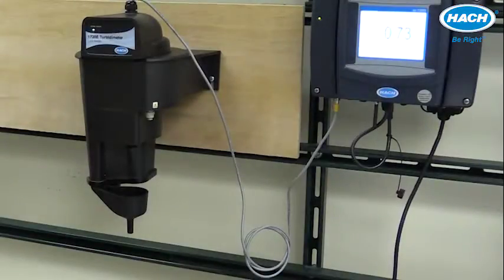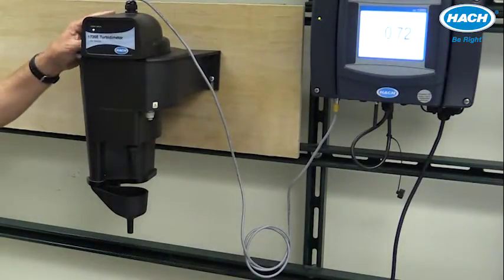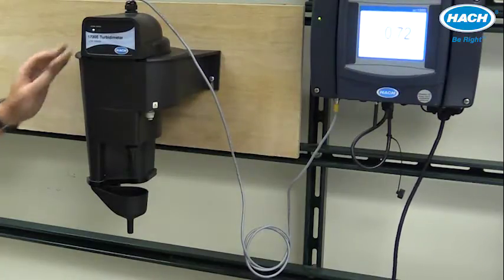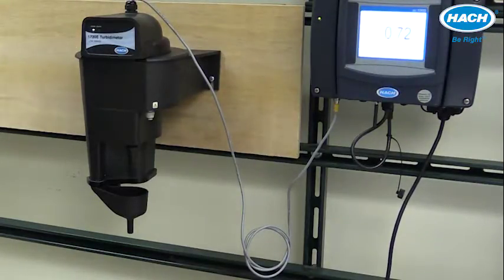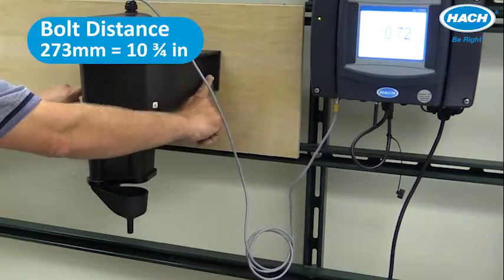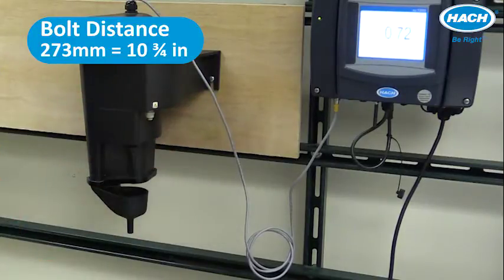If you're replacing an existing 1720e or FilterTrac 660 process turbidimeter, it's very easy to replace with the 5400 because the two mounting bolts are exactly the same from the previous instruments to the new mounting brackets, 10 and 3/4 inches apart.